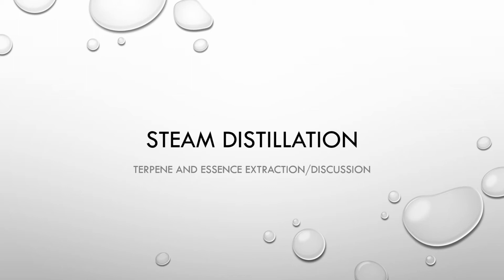Hi everyone, this is Ryan from Gold Leaf Scientific, and I'm going to be talking today about steam distillation of terpenes.